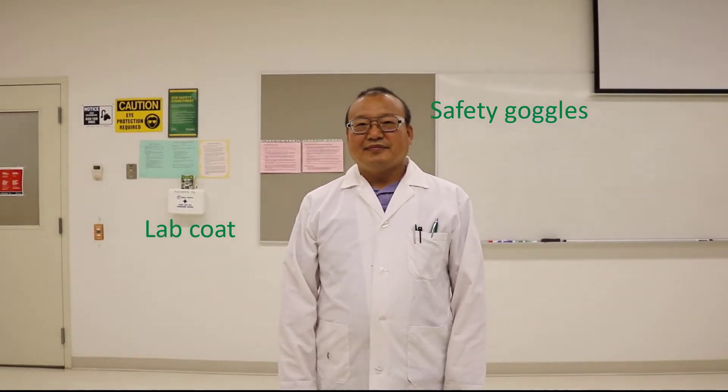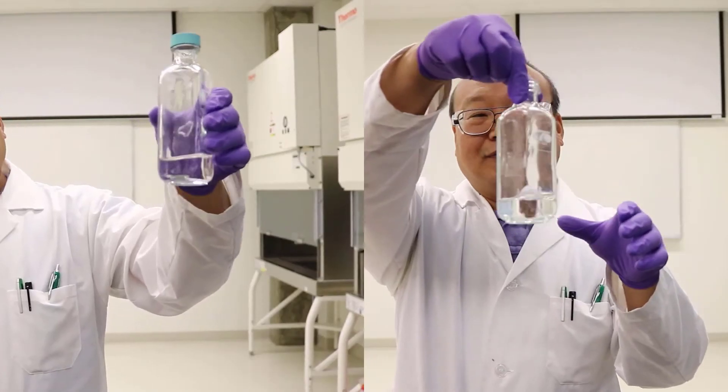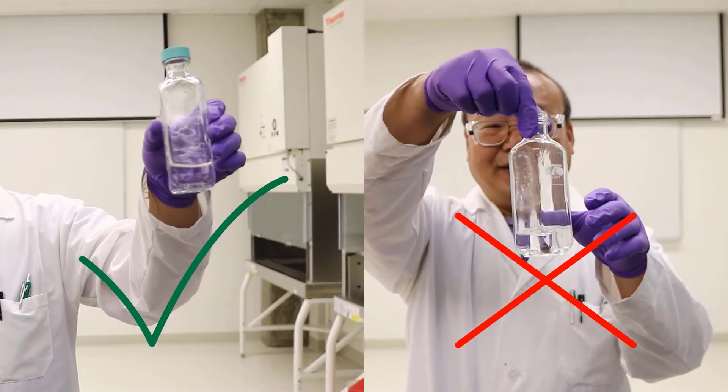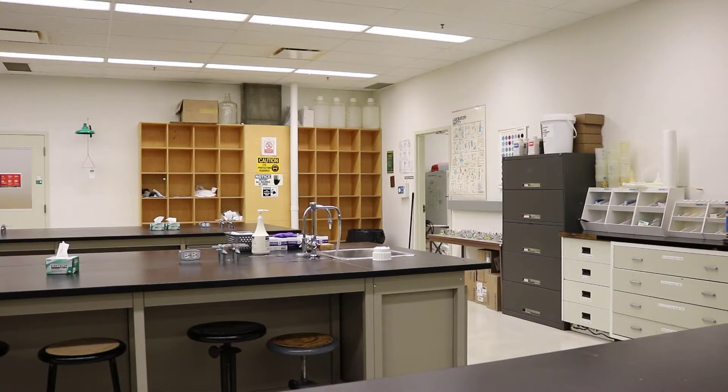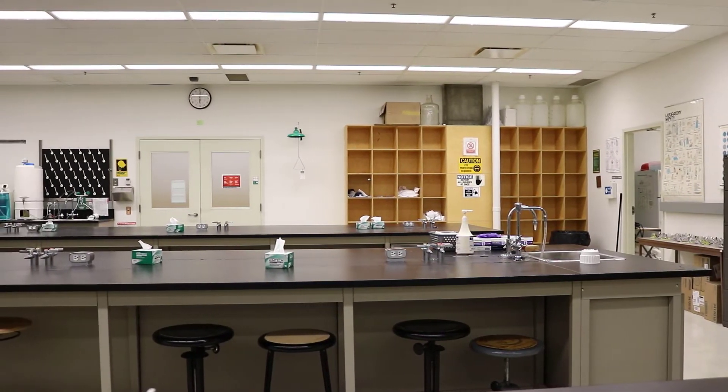This includes wearing safety goggles, a lab coat, and gloves. Also make sure your hair is out of the way. Glass bottles may cut your fingers — always hold them in the middle. Finally, be careful of any water on the floor. Walk slowly in the lab.